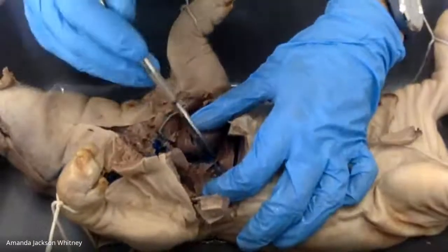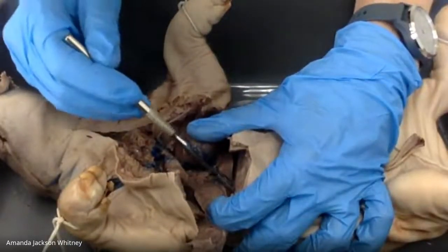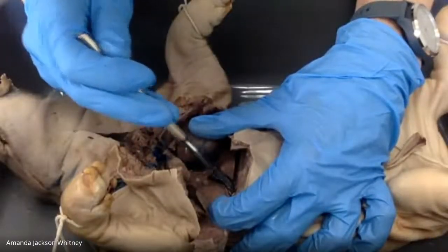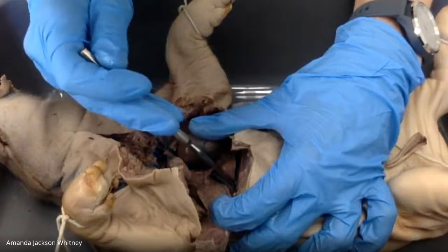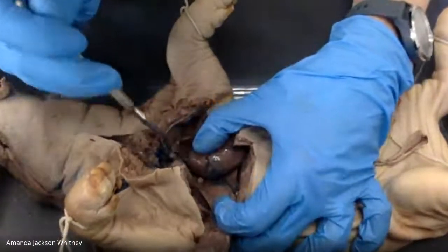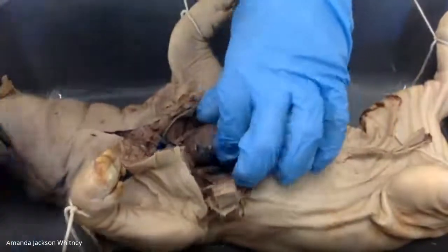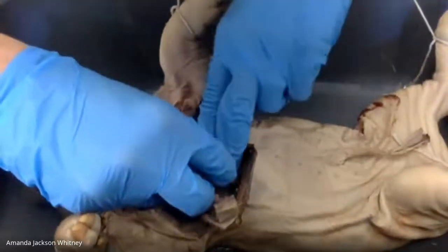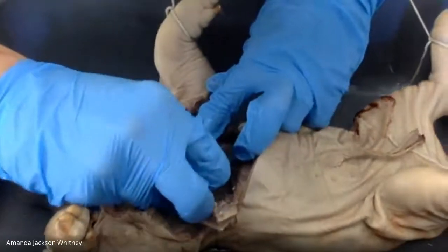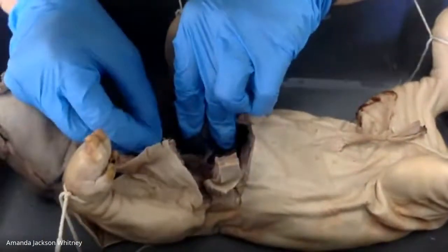Okay, so I don't know how easy this is to see. Hopefully you can kind of see it, but do you guys see this blue thing right down here? Yeah, this is the inferior vena cava. So remember, that's that big blood vessel from down in the lower part of the body that's bringing blood back to the heart. And I already cut through it, but up here is the superior vena cava that's bringing blood into the heart. The aorta is also here. It is difficult to see in this pig because there's a lot more blue latex than red for some reason.